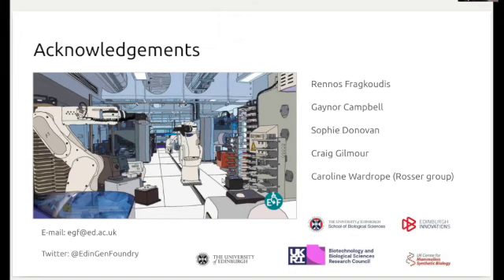Yeah, so we have performed many projects on the Berkeley Lights. I'm not involved in the lab work of that, but I don't think it's suitable for bacteria. And I don't think we're planning to apply it to the yeast system as well. So currently we're working with mammalian cells and the various workflows that we are currently getting training on as well. Thank you.